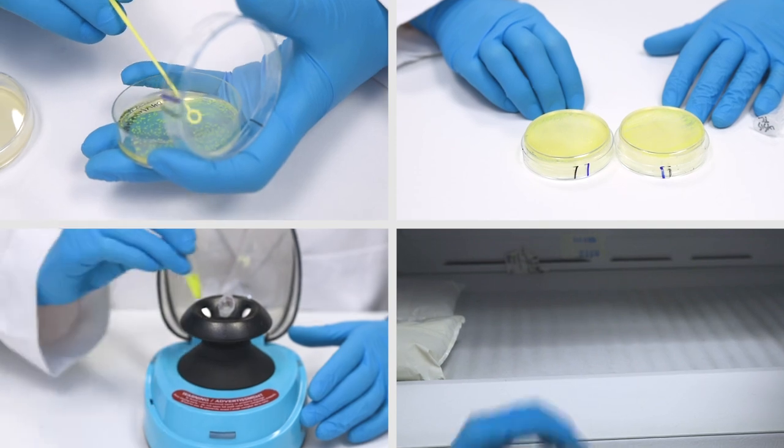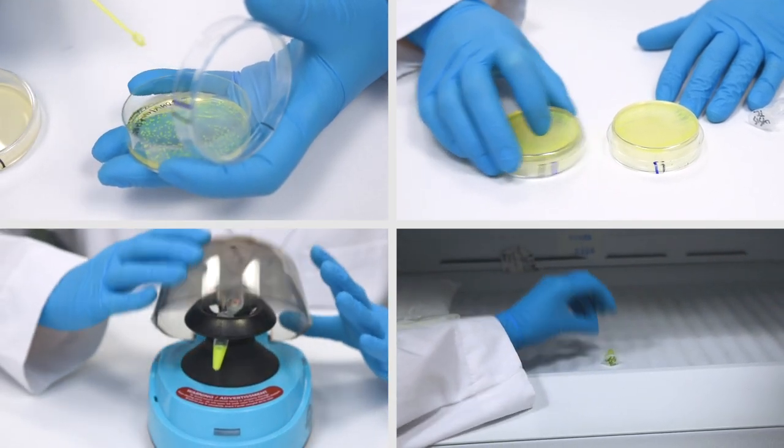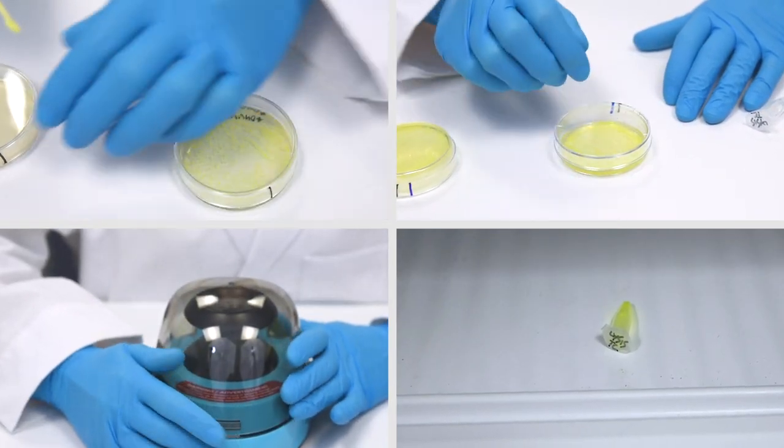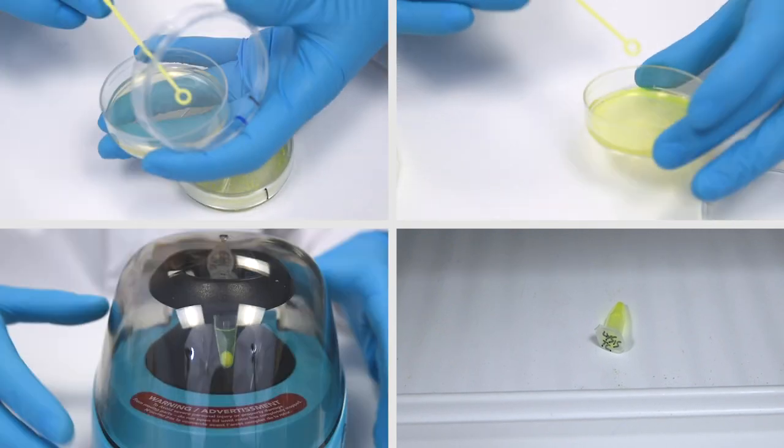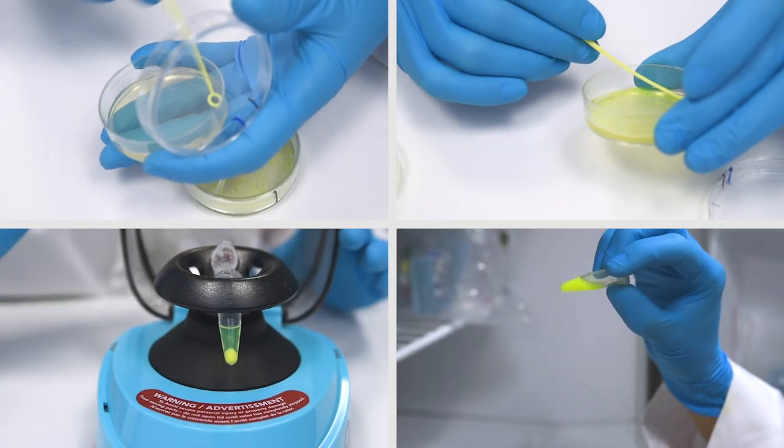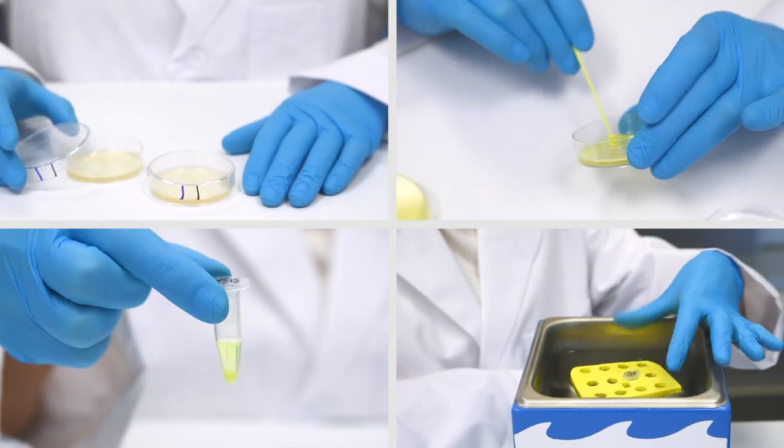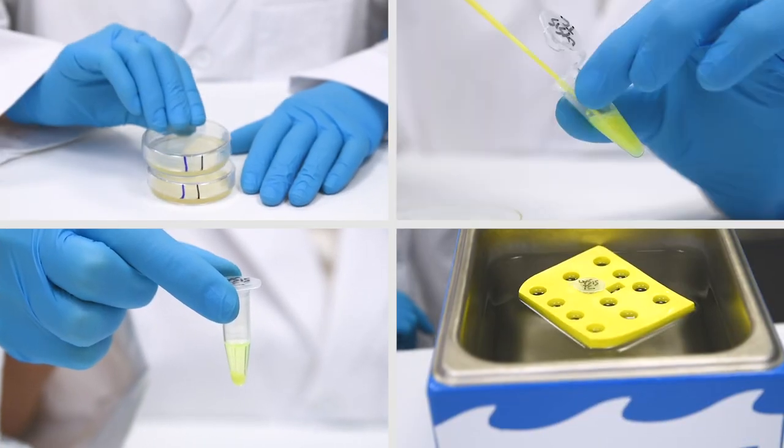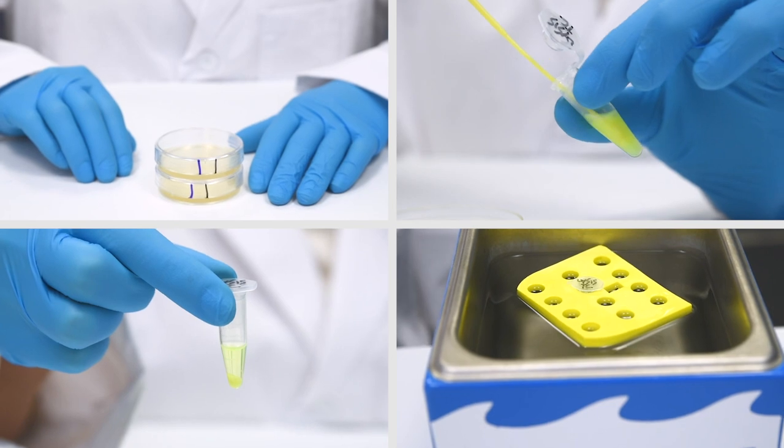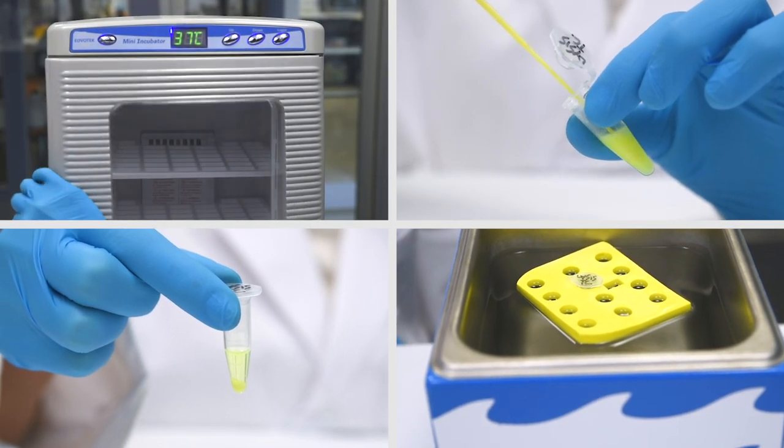In Module 2, you will select GFP expressing colonies from the transformation plates created in Module 1. The bacteria will be grown overnight on LB agar plates containing ampicillin and IPTG. Next, the bacteria will be collected and lysed to release the GFP for later purification.